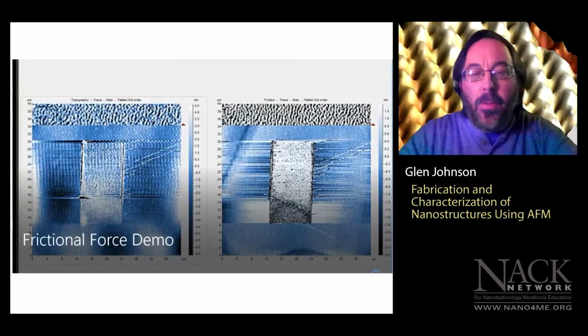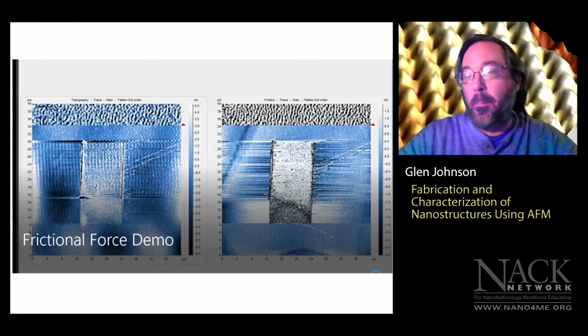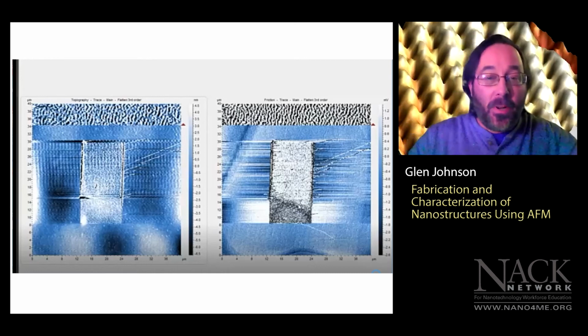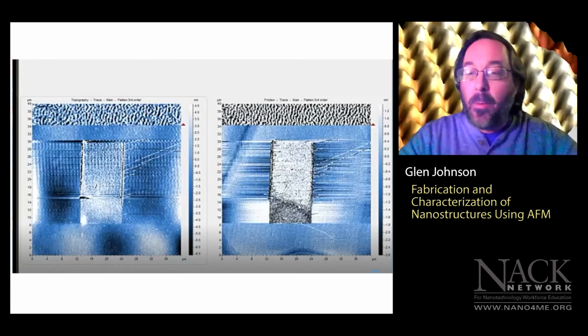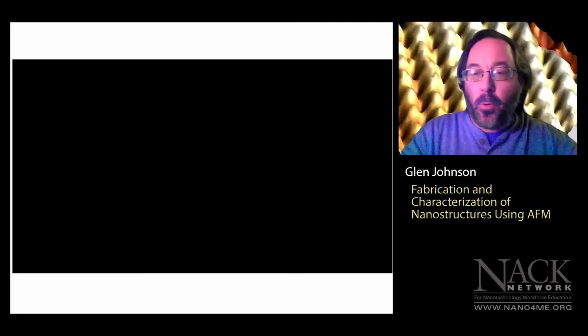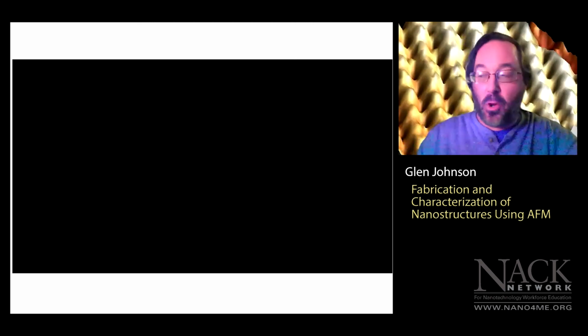Okay, so this was an example of frictional force microscopy or lateral force. So in the other demonstration, I'm going to show you phase, or attempt to show you phase if the microscope will behave. Okay, we're all set.